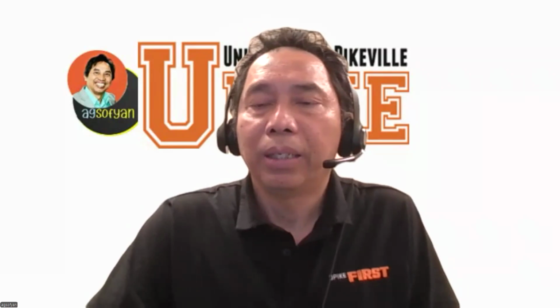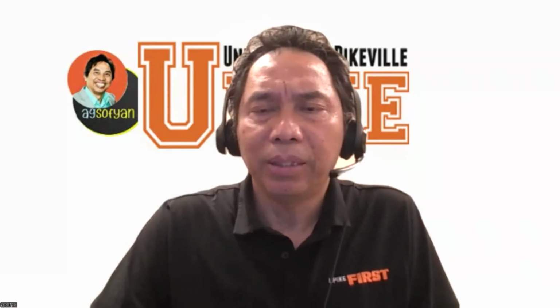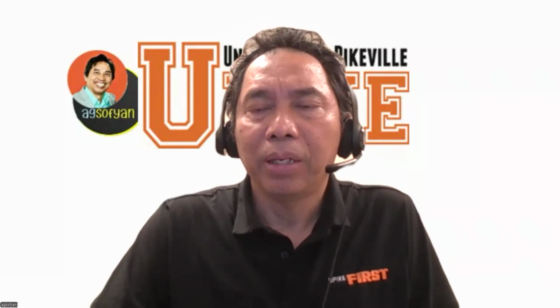So I will explain how to do lab experiments in McGraw-Hill Connect. I'm going to share my screen.